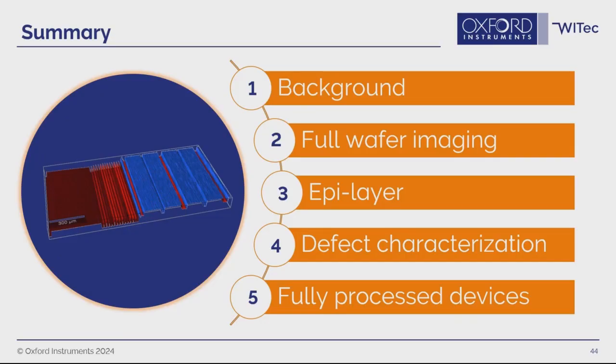Finally, we had a look at fully processed devices. Here we looked for contaminations on the contacts and investigated the topography of the microchip.